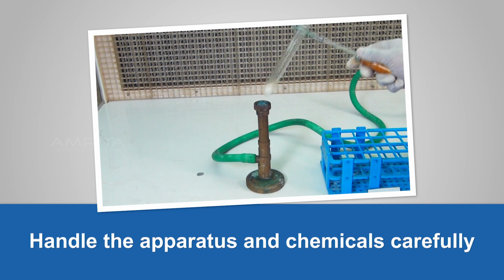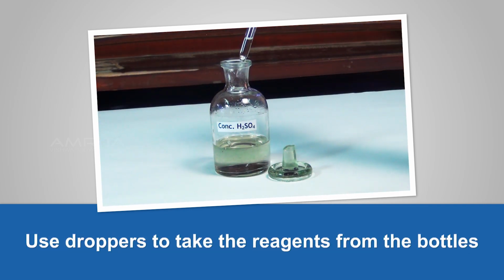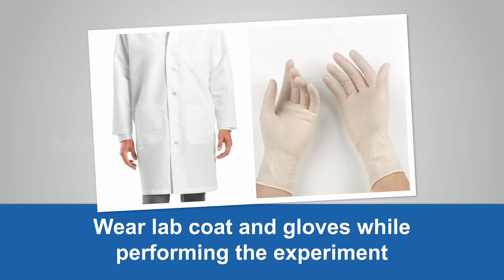Precautions: handle the apparatus and chemicals carefully. Use droppers to take the reagents from the bottles. Wear a lab coat and gloves while performing the experiment.